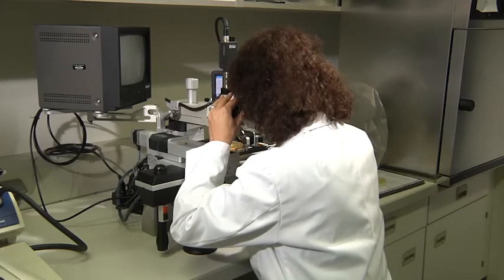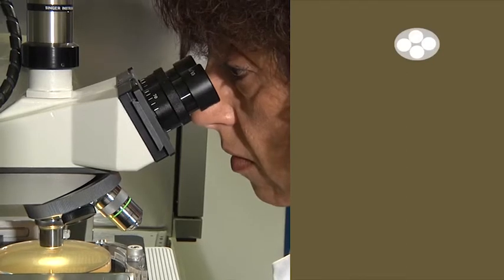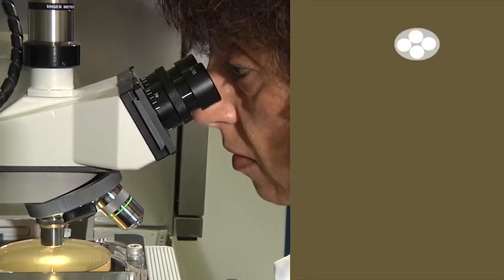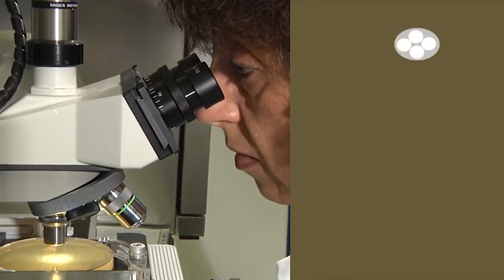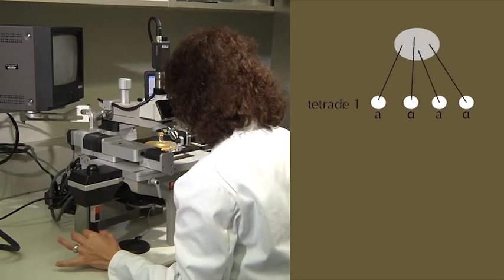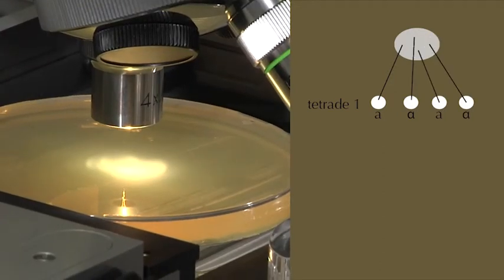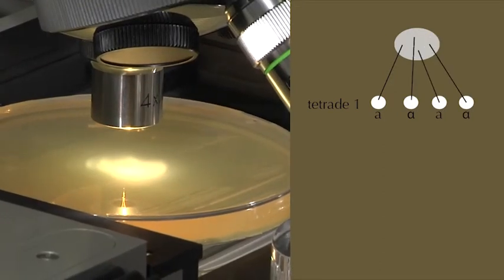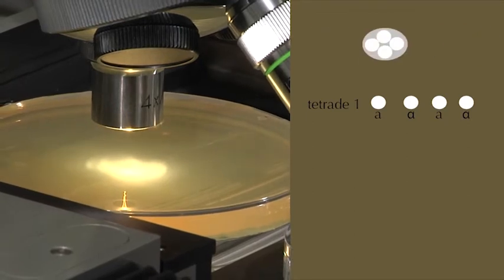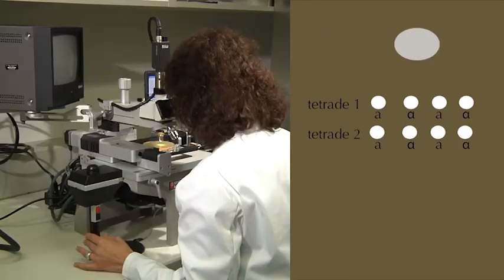After sporulation, the tetrads are plated onto agar dishes. Each tetrad is approached individually and dissected with the help of a fine needle tip. The single spores are transferred to new positions where they grow as individual colonies. This procedure is reliable, however time-consuming.